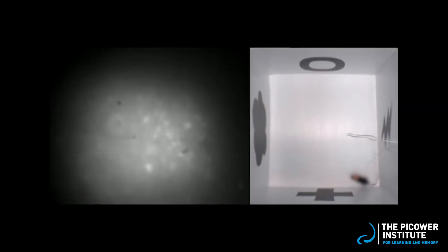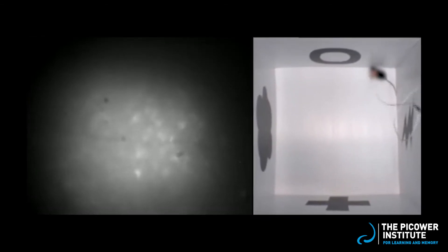The Wilson Lab has more recently been using calcium imaging to study the hippocampus. In this experiment by postdoc Jack Zhang, the video on the right shows a mouse exploring an arena, while the video on the left shows hippocampal activity. The bright spots that come and go reflect changes in calcium in hippocampal neurons as the mouse explores the space. Calcium imaging allows us to monitor large numbers of neurons at the same time. This means we can watch as groups of neurons interact to form memories.